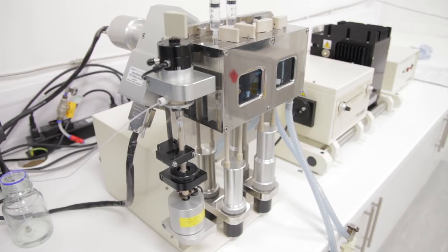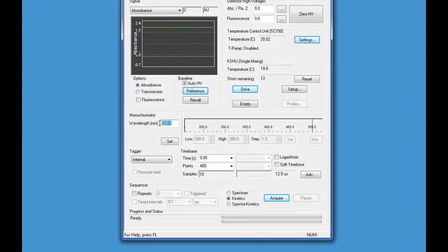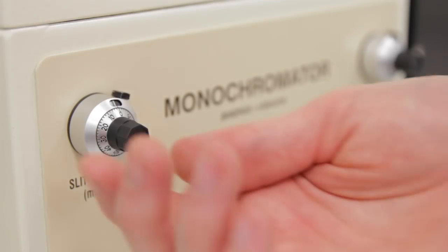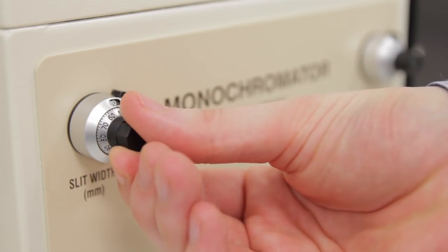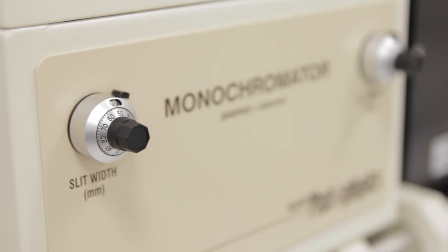Use the monochromator setting to select the desired wavelength and make sure the slits of the monochromator are set to appropriate settings. Typical settings for absorbance measurements are 0.5mm for both entry and exit slits. Though as we shall see in a moment, it may be necessary to modify this depending on the amount of light that reaches the detector.